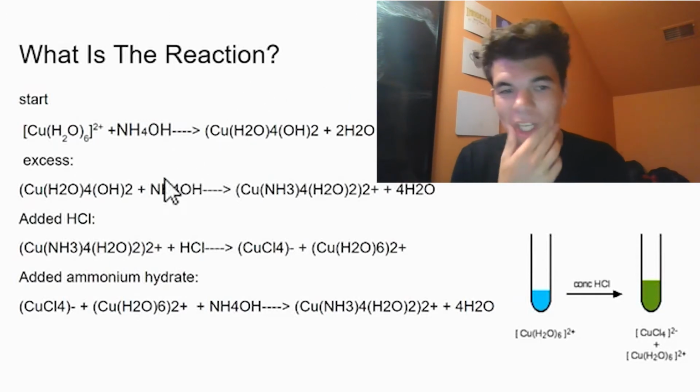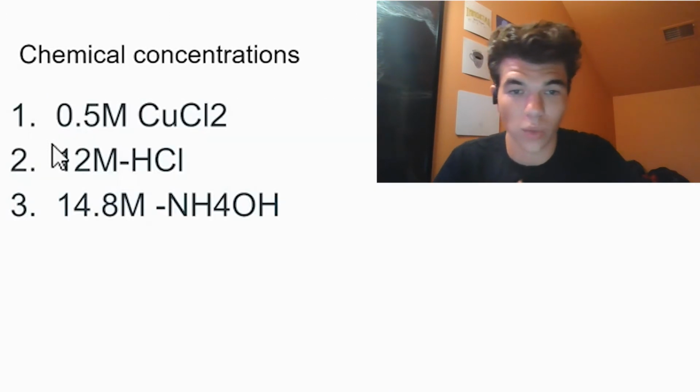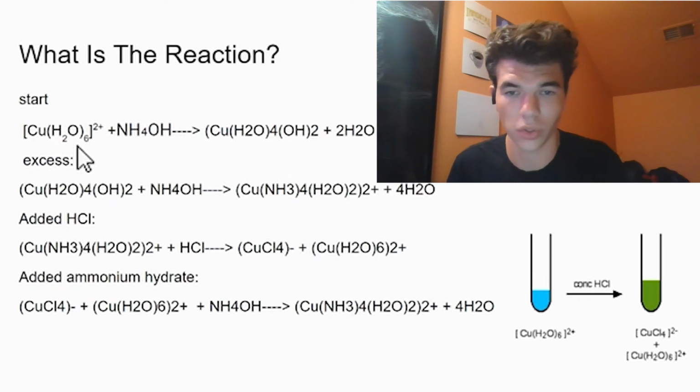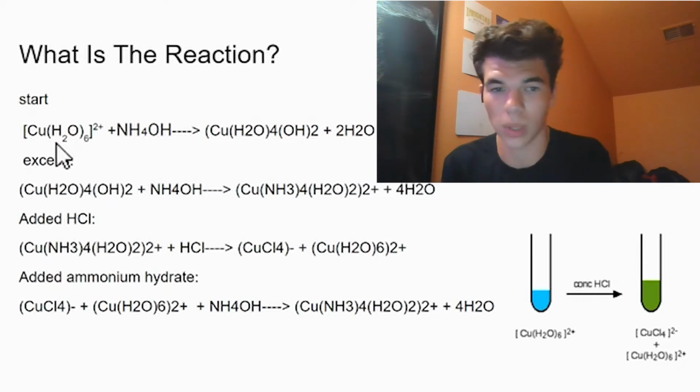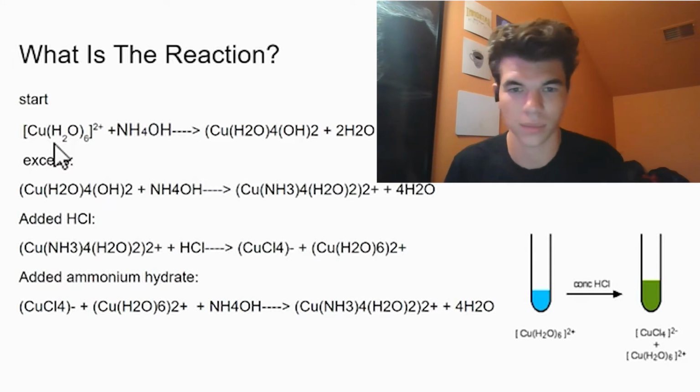So, what is the reaction that's taking place? In this reaction, it's going to be a copper and water complex that's created from copper chloride in solution disassociating into the water into Cl- and Cu2+, which then makes the copper and water complex.